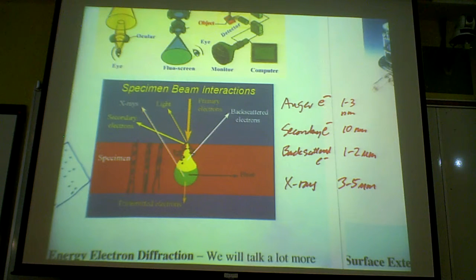There's a question here, thanks. When we are probing through a scanning electron microscope, we have two modes, like secondary electron mode and then backscattered electron mode. But how does the detector differentiate between these are secondary electrons and these are backscattered electrons?